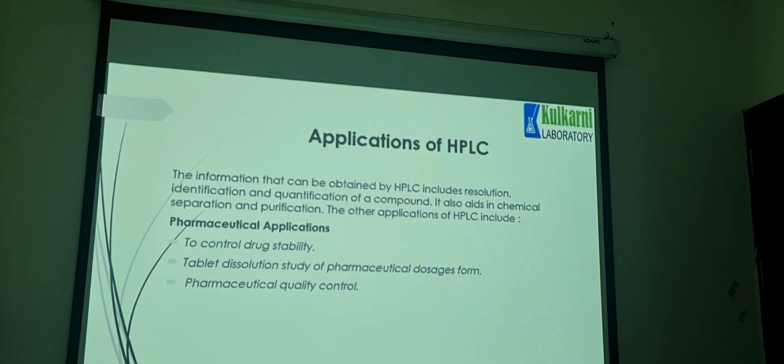The other applications of HPLC include, what are the other applications of HPLC? Can anybody read? Pharmaceutical applications, to control drug stability, tablet dissolution, study of pharmaceutical dosage forms, pharmaceutical quality control. So these are some applications in which the HPLC technique is involved.